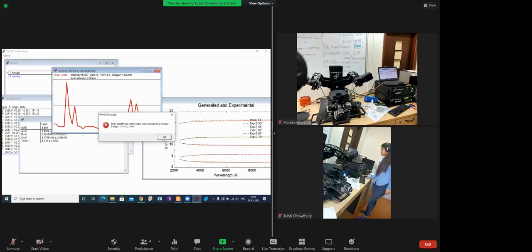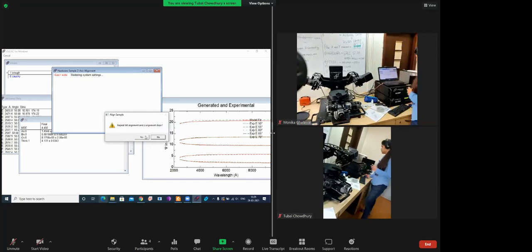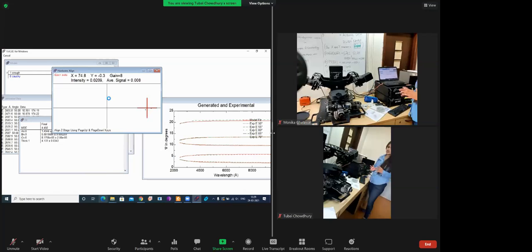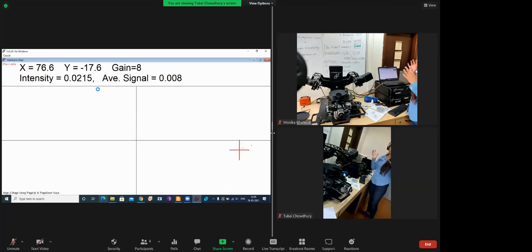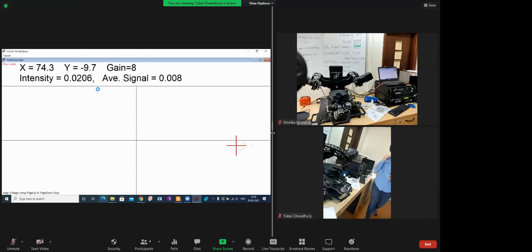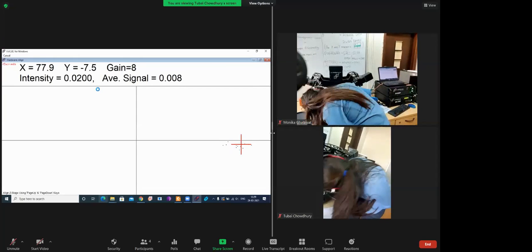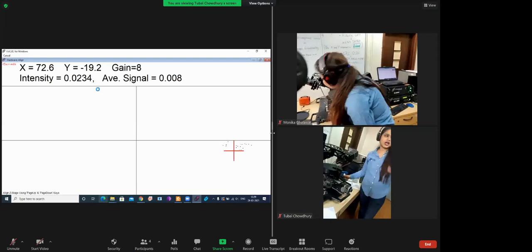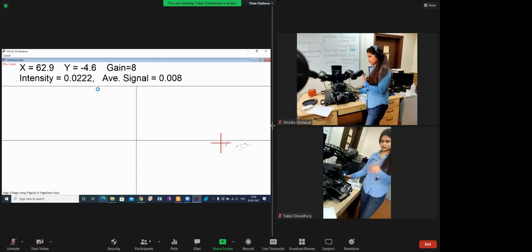It's not appropriate yet because the sample size is very small. As I told you, in the case of a small sample there will be an issue. The gray area is not there. So I have to check whether we are getting signals in the detector. We are not getting any kind of signal in the detector.